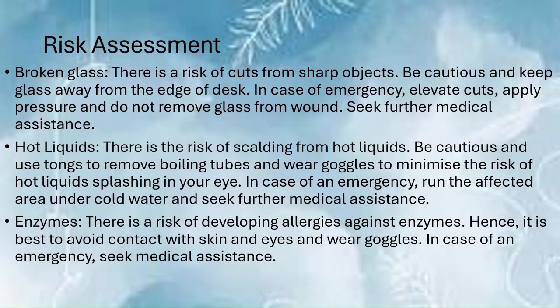The risk assessment of this practical. So there's the risk of broken glass, there's a risk of cuts from sharp objects, so be cautious and keep glass away from the edge of desks. In case of emergency, elevate cuts, apply pressure, and do not remove glass from the wound, and seek further medical assistance.